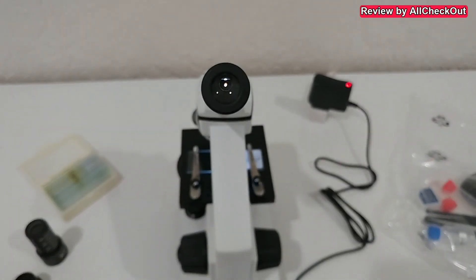I'm trying to show you something here with the camera — this gives you more or less what you can see in real life. I'm testing the different light options, from top and below. The light definitely helps — without it you can't see anything. The camera shows quite some detail, but I can tell you with your real eyes it's much sharper. This gives just a basic impression, but I would say the quality of the optics is really good.